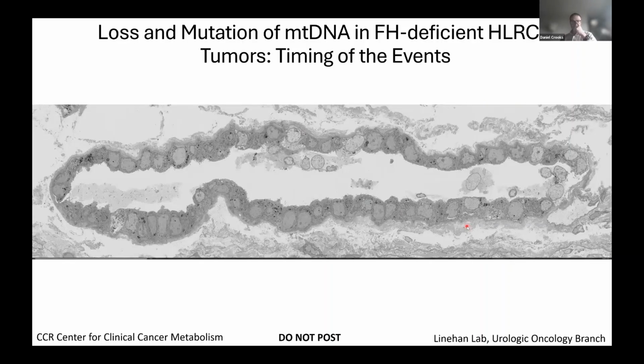And recently with Ruqing and her colleagues, we've had this really awesome opportunity. She just sent this particular image yesterday. It has been the holy grail to get material from these cysts to do EM and other studies on, because Dr. Marino typically wants to take all of them, understandably, for pathology and diagnosis. But in this case, we were able to get a small piece of that cyst that I just showed you. And this is just an image of a tubular region of that cyst.